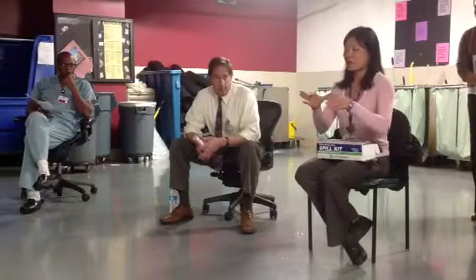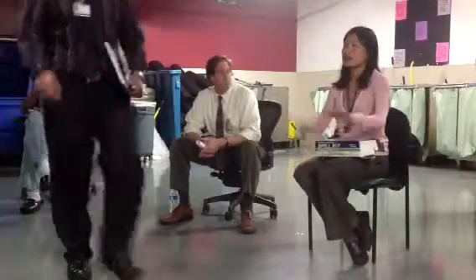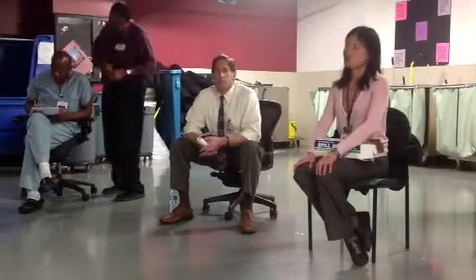Material to, and we are trained to perform large scales of spill. So small spill is anything below 20 cc, which is about this big. And again, if there's something you are not very comfortable with, if these liquids somehow get into some really hard to reach area, you should contain the area and contact safety, and we will be able to perform the cleaning.